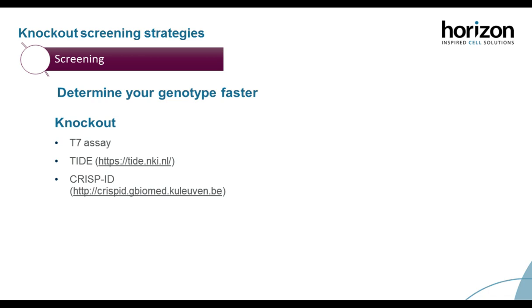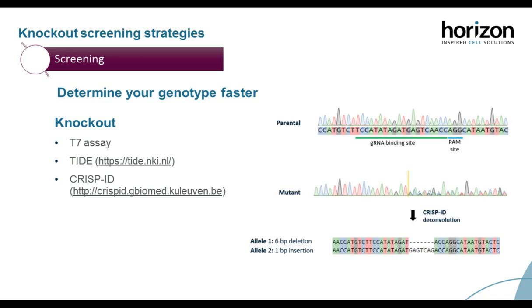Then we look at the mutant clone that I have generated, and we can see there is a mixed trace in and around the guide RNA cutting site, suggesting that there has been an incorporation into that DNA, so there are two different genotypes now in that gene.